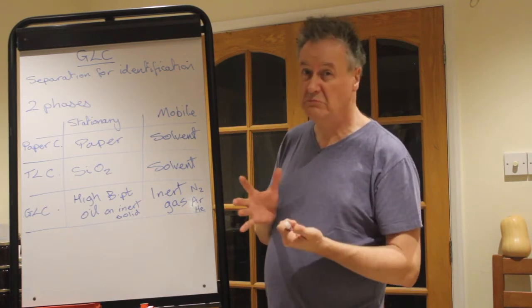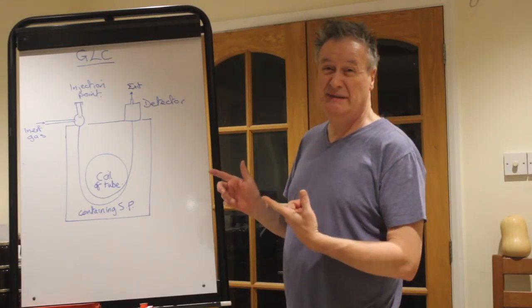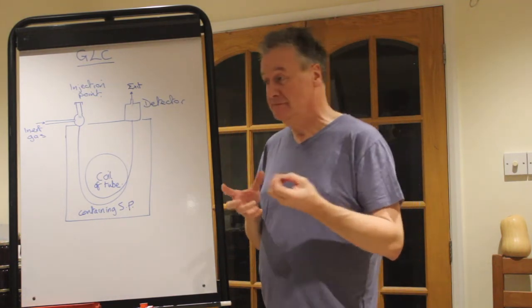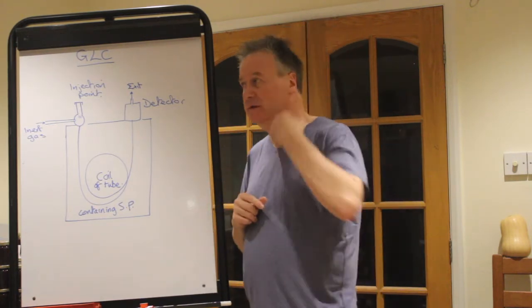You do need to have some idea what the machine is internally looking like. So we're going to have a little drawing on the board, which means I'm going to have to wipe this, and we're going to have a little edit. See you in a second. So, a little schematic of it. Obviously it would be completely sealed in a case with some control dials and stuff to make it do what you want to do.